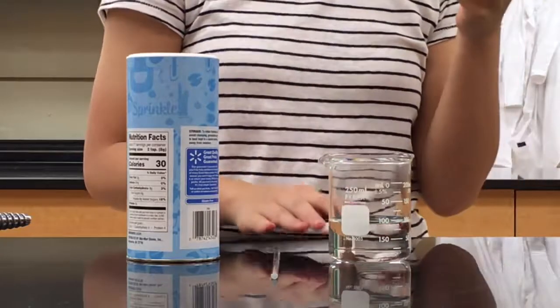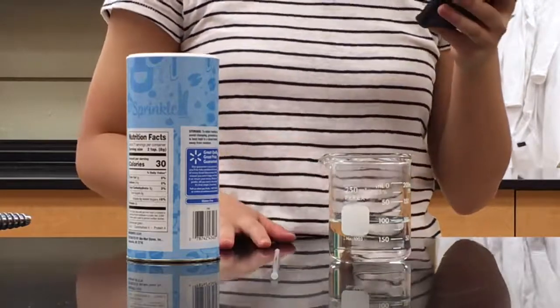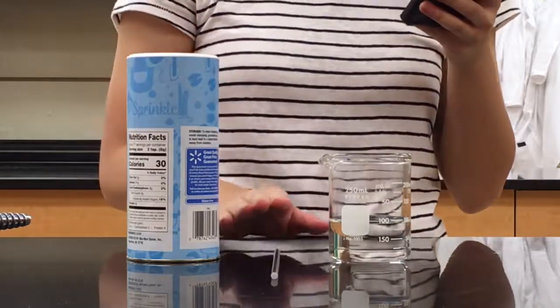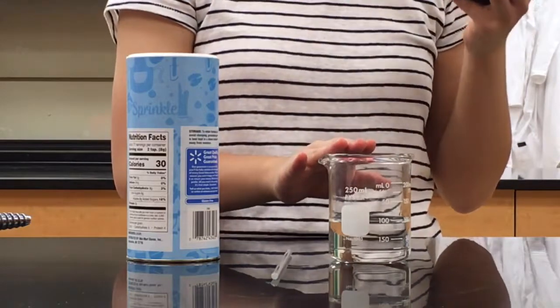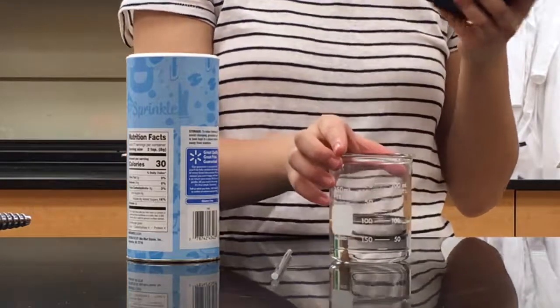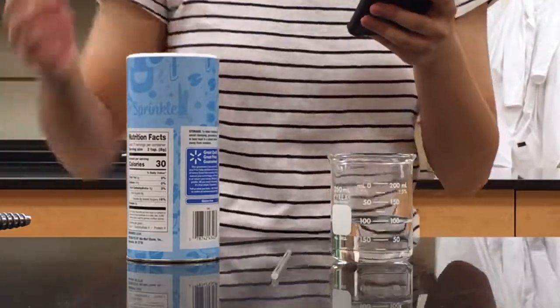So today we're going to be doing the particle nature of matter experiment. What you're going to need is some sugar, a glass stirring rod, a 250 milliliter beaker filled with 100 milliliters of water, and that's it.